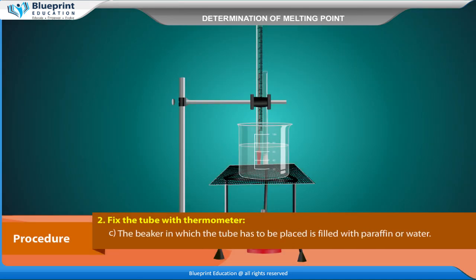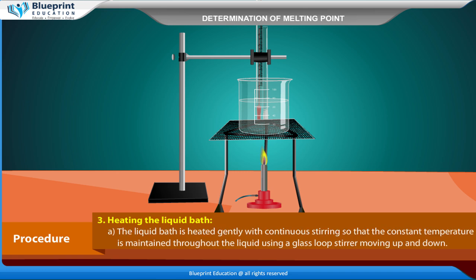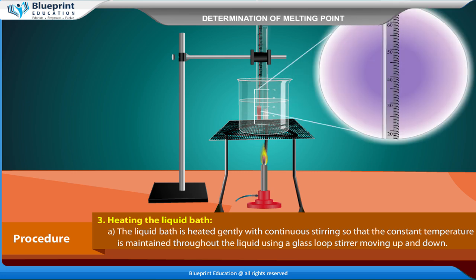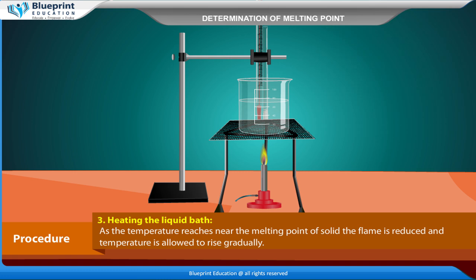The beaker is filled with paraffin or water. Heating the liquid bath: the liquid bath is heated gently with continuous stirring so that a constant temperature is maintained throughout the liquid, using a glass loop stirrer moving up and down. As the temperature reaches near the melting point of the solid, the flame is reduced and the temperature is allowed to rise gradually.